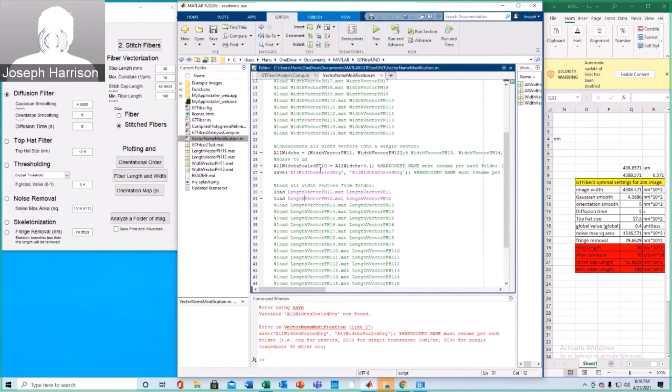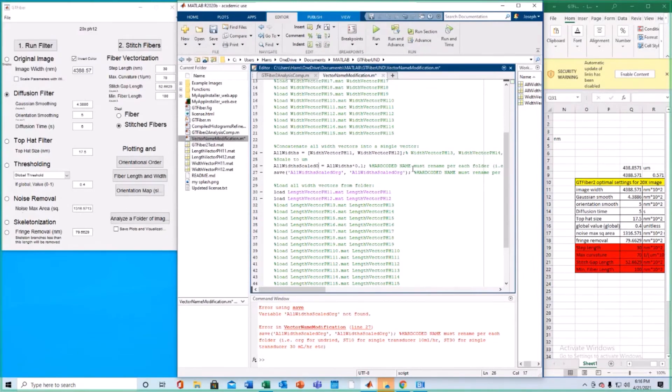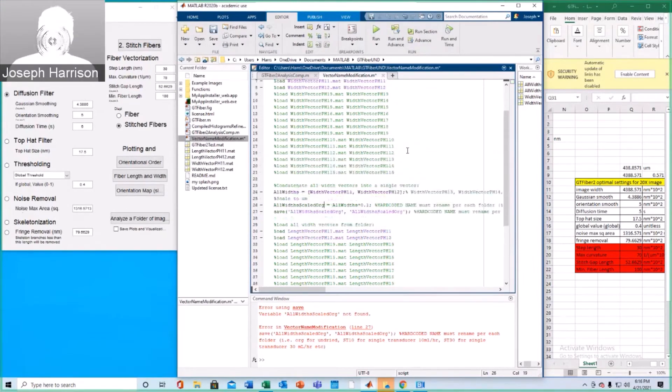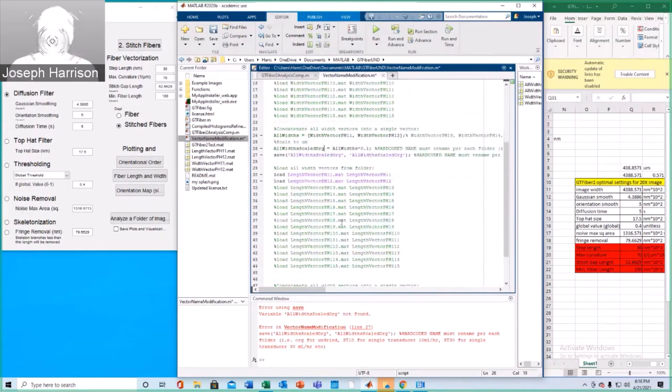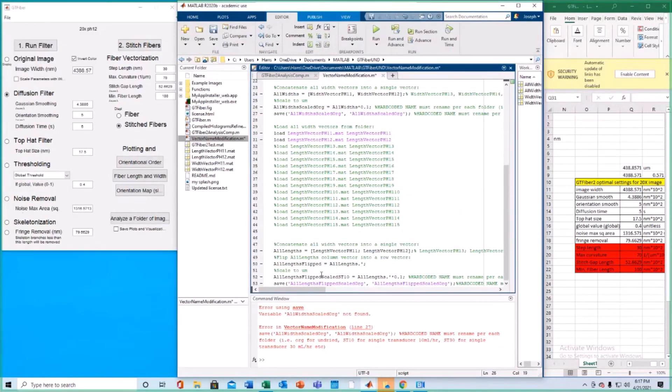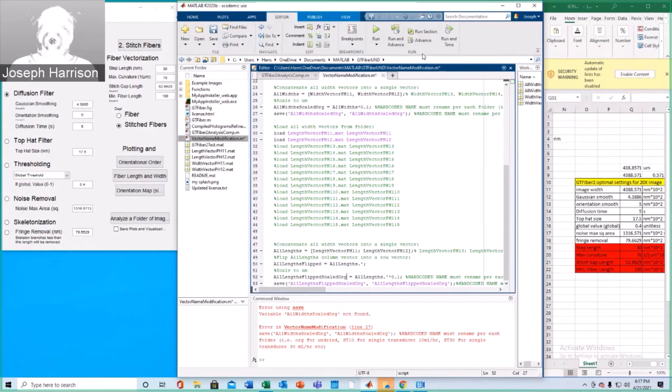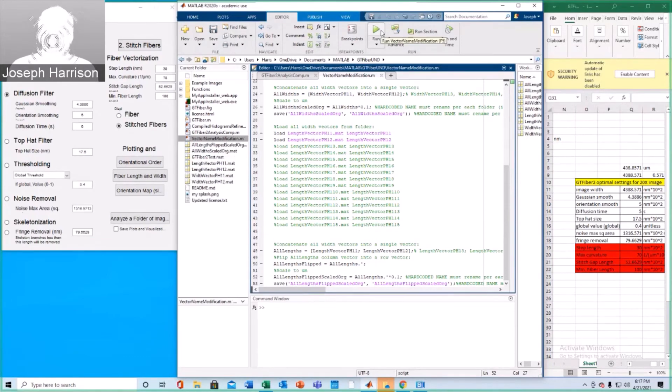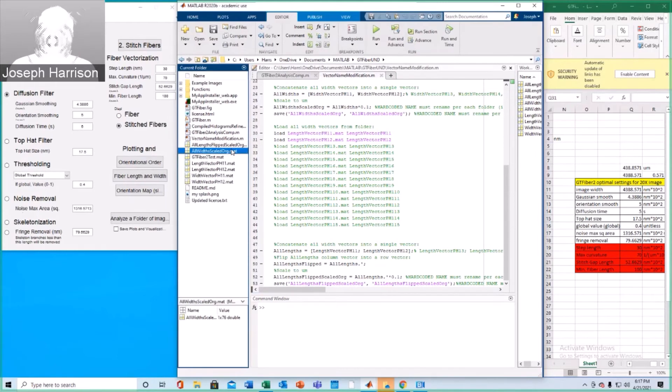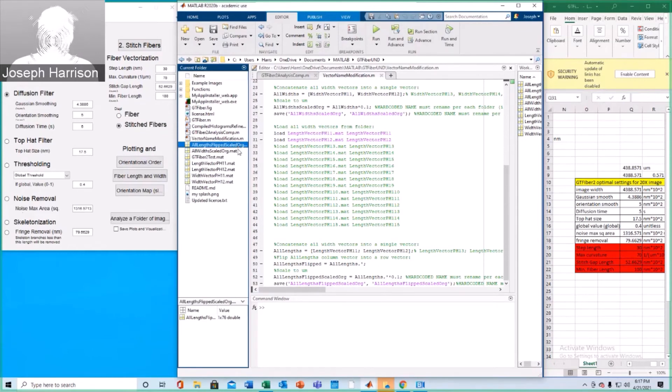Alright, I believe everything has been updated and we can run this. Okay, so the error here is we forgot to name this accordingly. Make sure to update all of the hard-coded names or else you're going to get errors. That's got an st10. We need that to say org. Try it again. Alright, that worked. So now we have a length vector and a width vector. We had to flip the length vector because it was previously saving as a column vector and I believe we wanted it as a row vector. Actually, I believe it's vice versa.